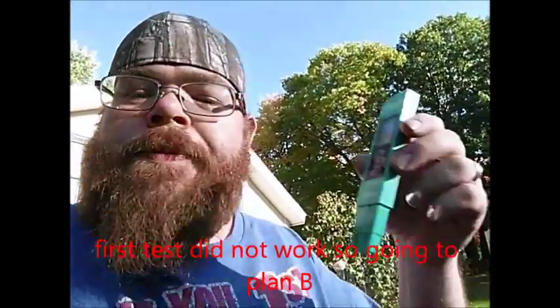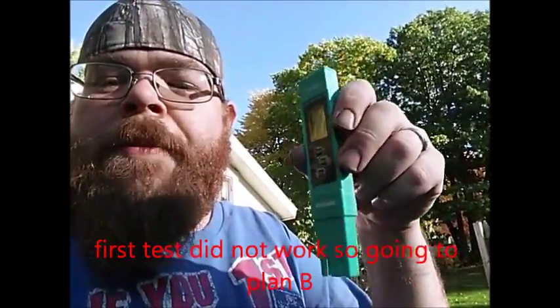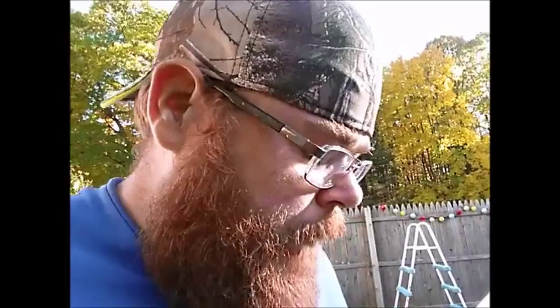I'm not quite sure about the conductivity measurement since I'm pretty sure all water is conductive, but anyway — you sink it right up to that line there, stick it in the water, stir it around to get all the air bubbles out, and you look at the meter. When it stops, you can hit the hold button, pick it up, and look at the reading.